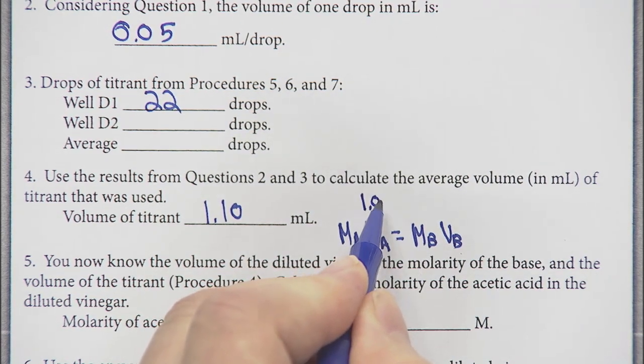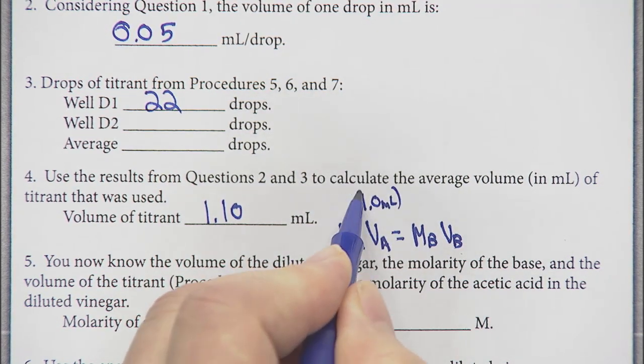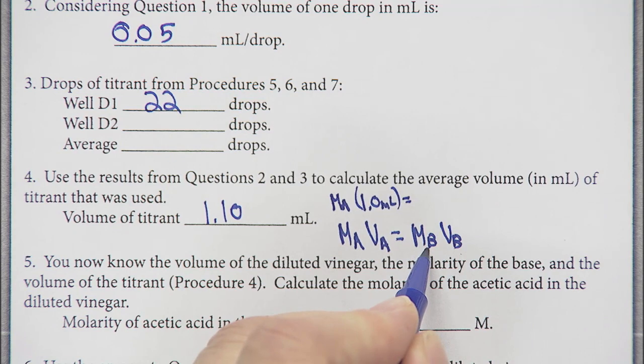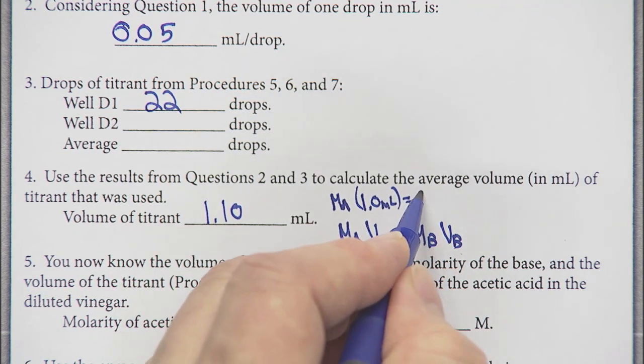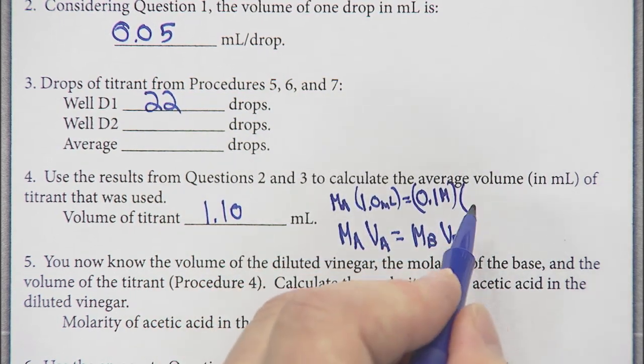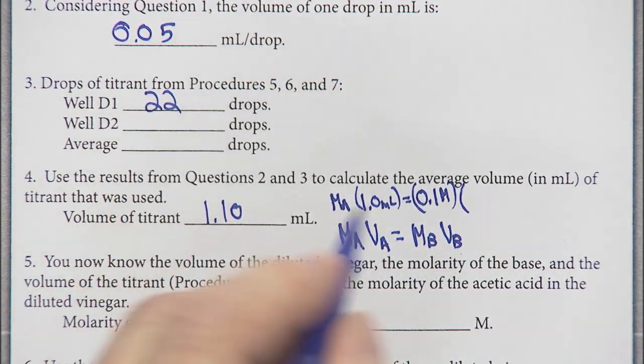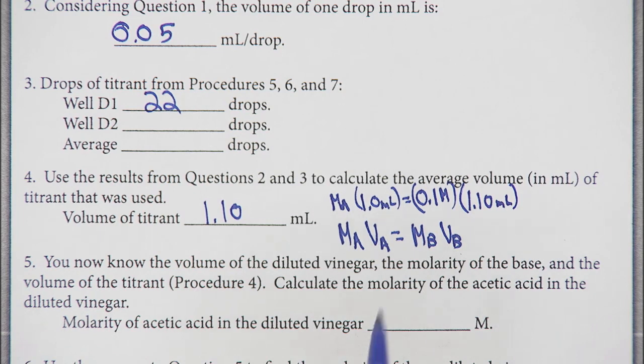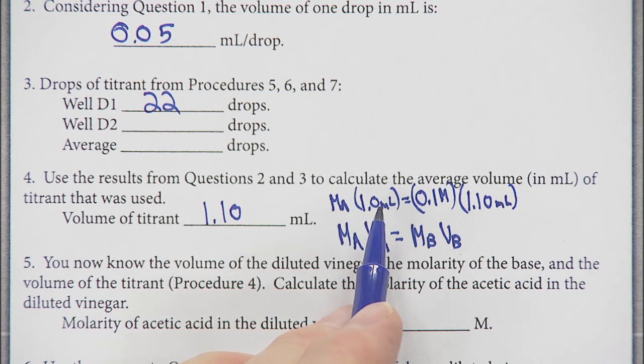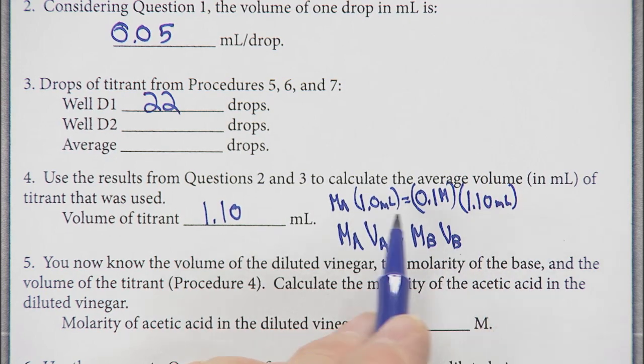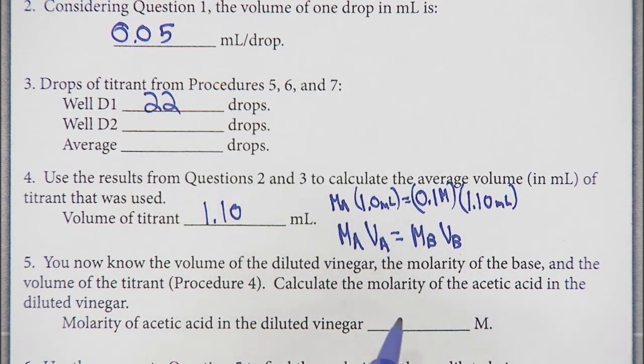The volume of the acid is one milliliter, that's how much we put into the well plate. The molarity of the acid we don't know. The molarity of the base was listed as 0.1 molar on the bottle, and the volume we just calculated is 1.10 milliliters. We got a 1 here, so 1 tenth of 1.1 is 0.11 divided by 1. The diluted acid is 0.11 molar.